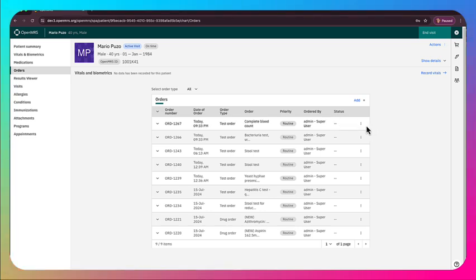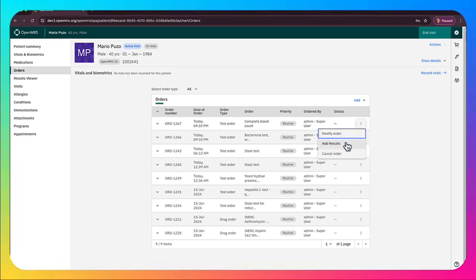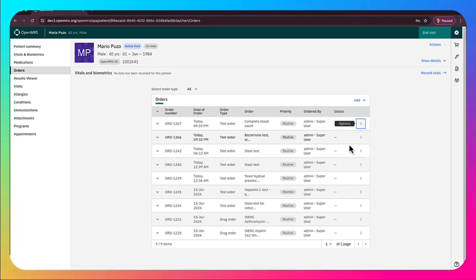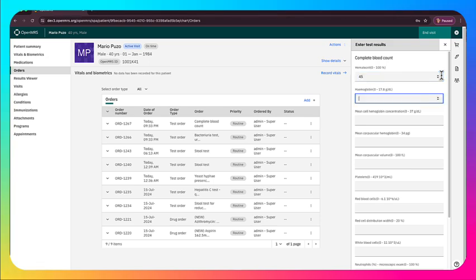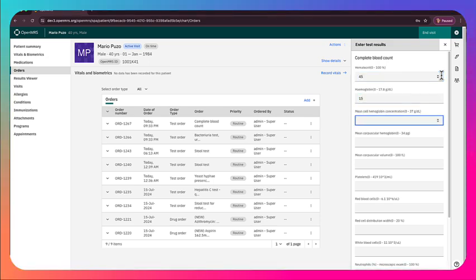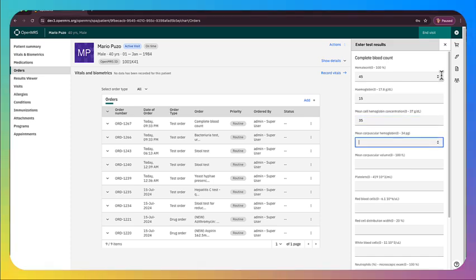I'll show you how to use that in a separate app. But if you had a lab information system, that status would be automatically updated. And of course, you'd be getting these results streaming back into OpenMRS as well.